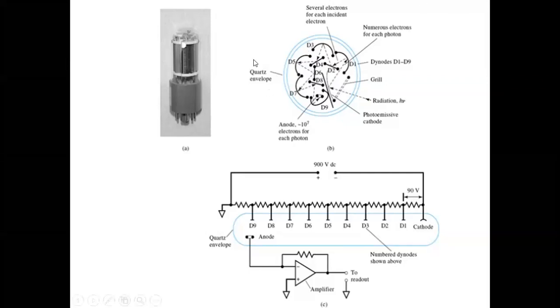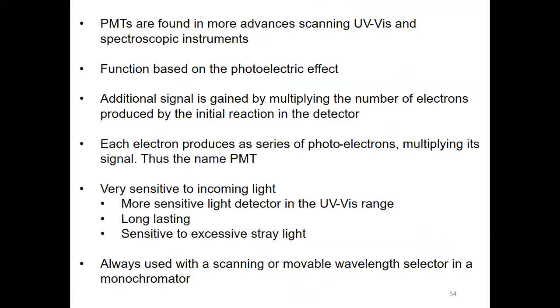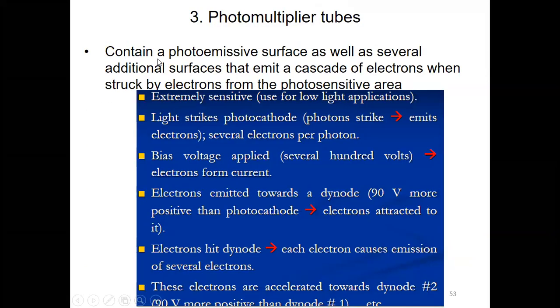I hope it's clear. This figure A, the image A, is a photograph of the photomultiplier tube. Okay, I just discussed the image. Then let's move back to what has been written here. Now I think it's clear. So now you know what is happening in the photomultiplier tube.